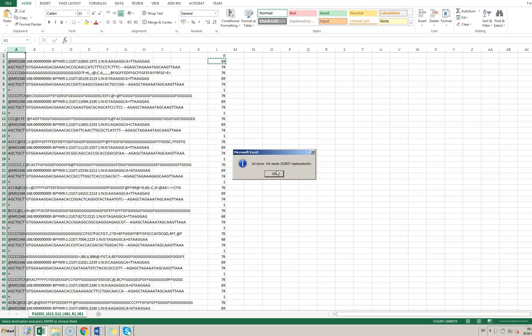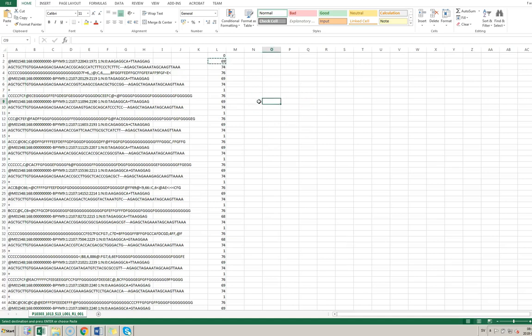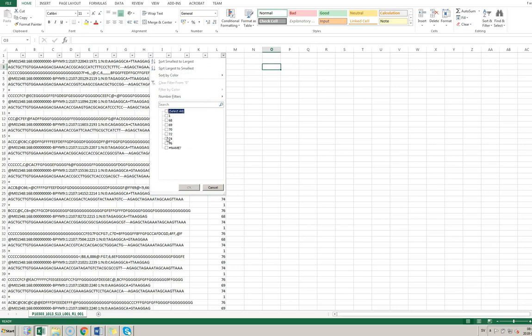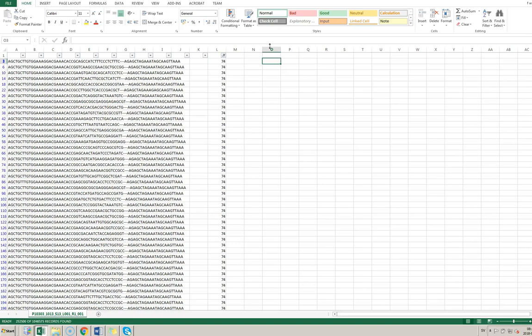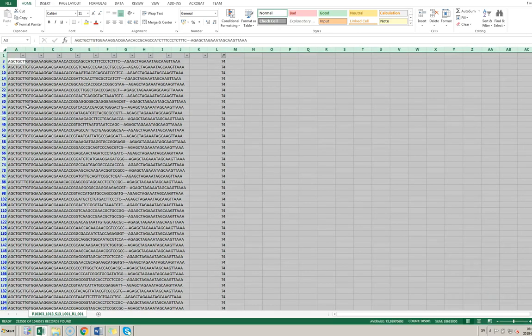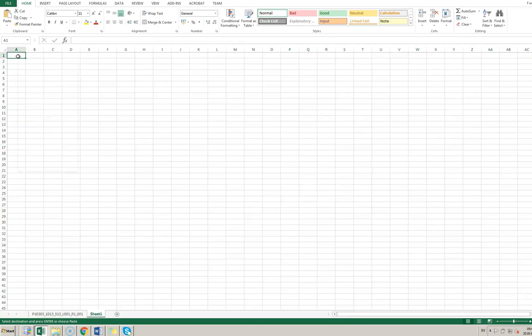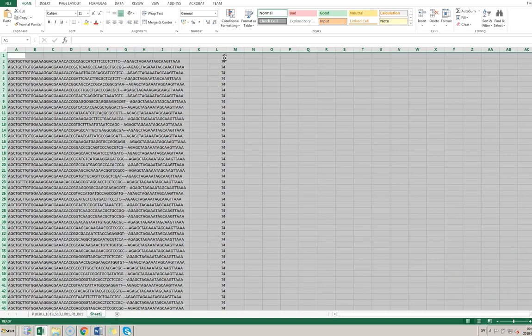It seems we have 252,937 sequences that fulfill this criteria. Now the sequence length has become 74, so I'm going to set a filter here to only show rows with length 74. We're making a lot of assumptions here and may introduce bias, but this is just to get a feel for the dataset. Then I press Ctrl+A to select everything and copy it, and paste it as values in a new location, discarding the data we didn't need.